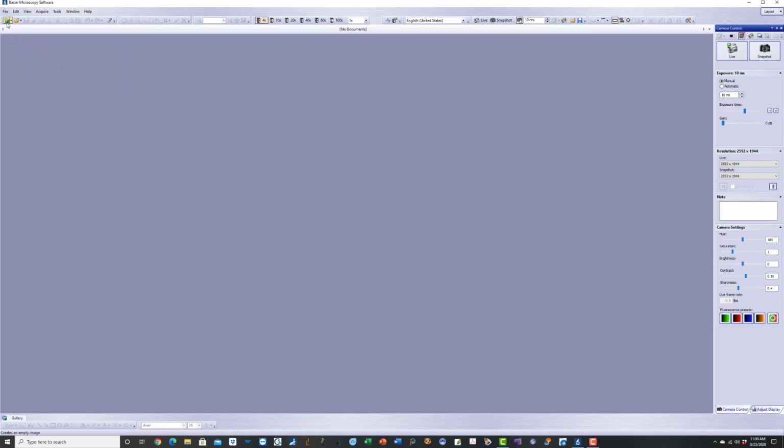So if I go from left to right, you have new image, open file, save file, send email, print directly, print preview, cut, paste, copy, undo, redo, context, help, pan tool, zoom tool, magnifying tool. They will be highlighted when you open an image. Selection tool, marquee tool, move tool, crop tool, confirm input, cancel input, zoom in and zoom out option, then actual pixel, fit to window for the image.